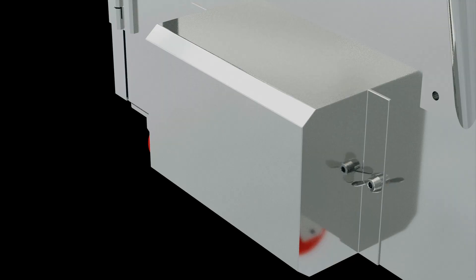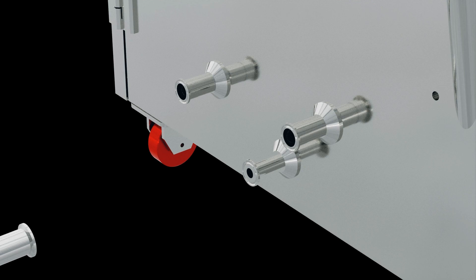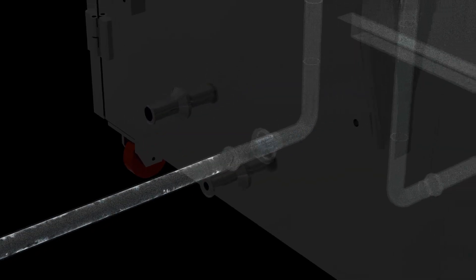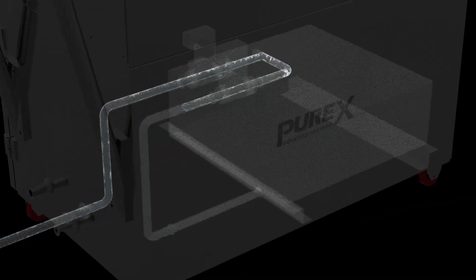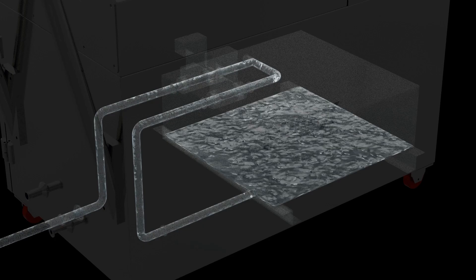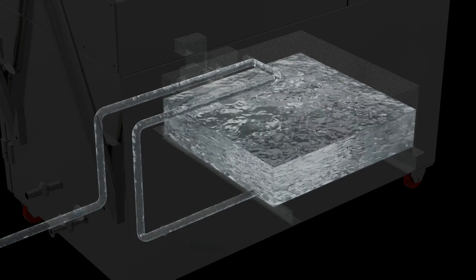The Purex Steam Sampler has the flexibility to operate either when connected directly to facility-chilled water systems, or it can operate remotely in harder to reach areas from an onboard chilled water tank.